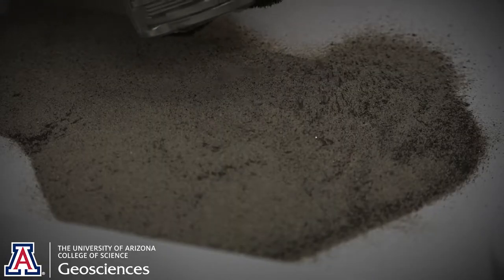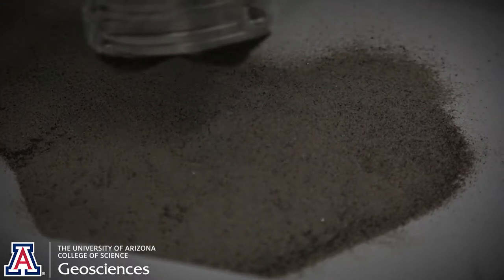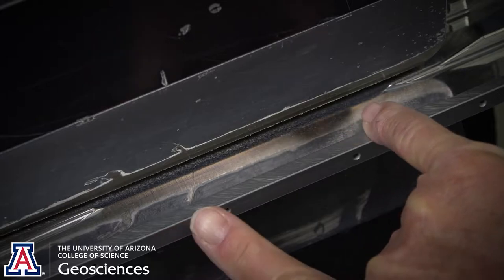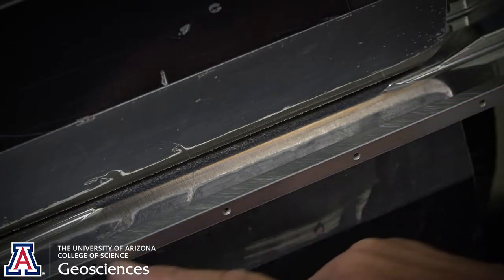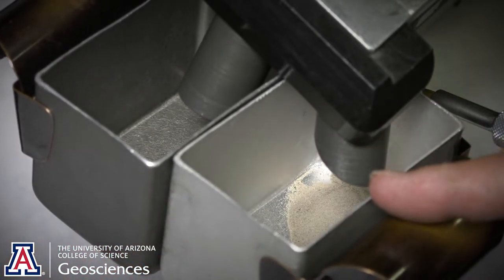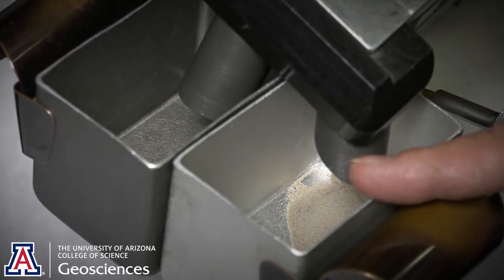My name is Galen Simpson, and I am the mineral separation lab manager. After we've used the hand magnet to get rid of iron filings and magnetite from the sample, the next step is the Frantz magnetic separator. The sample pours out of this tube and encounters the magnetic barrier — magnetic minerals cannot cross this barrier. The non-magnetic minerals drop down to the lower chute, while the magnetic minerals fall into the dark cup and the non-magnetic light minerals fall into the silver cup. Then we take this to the next step.